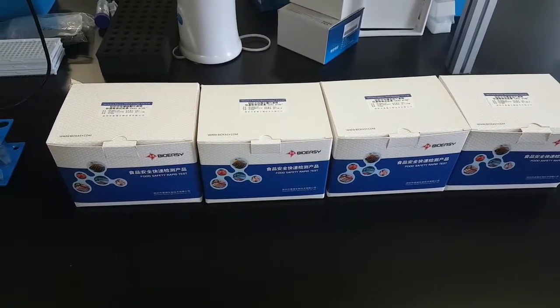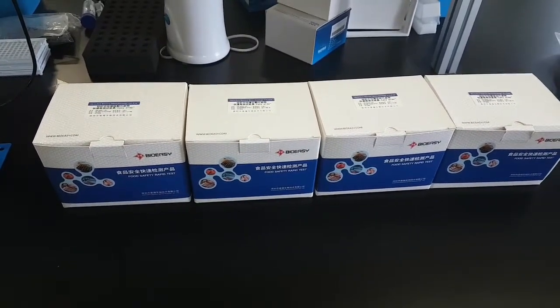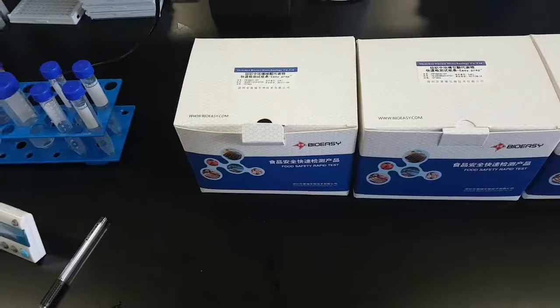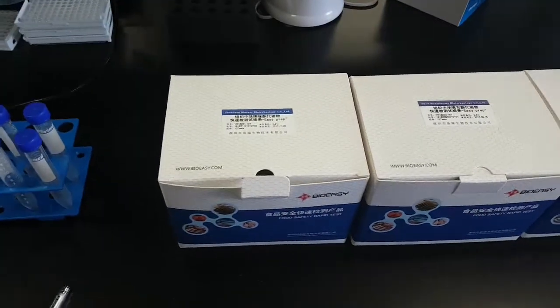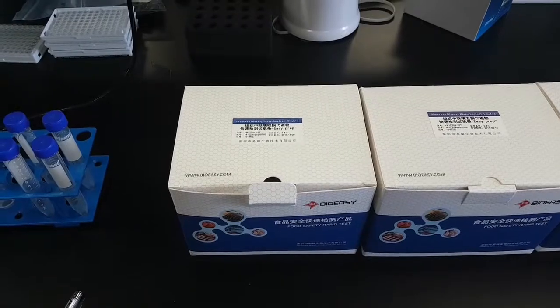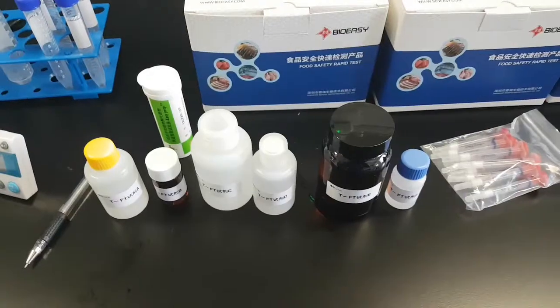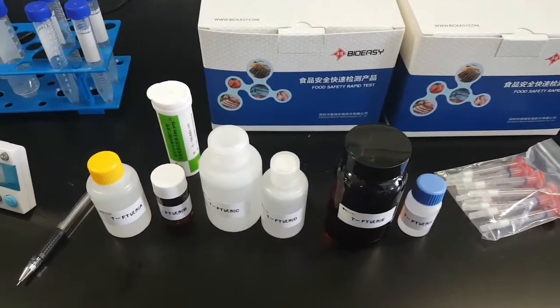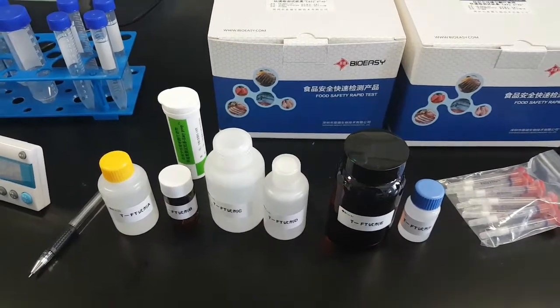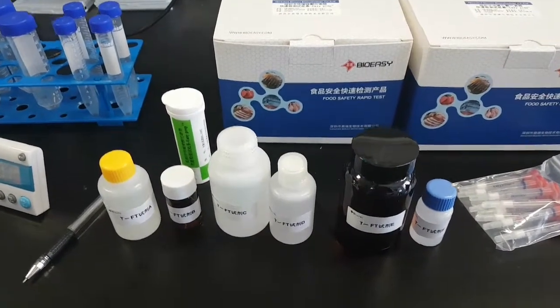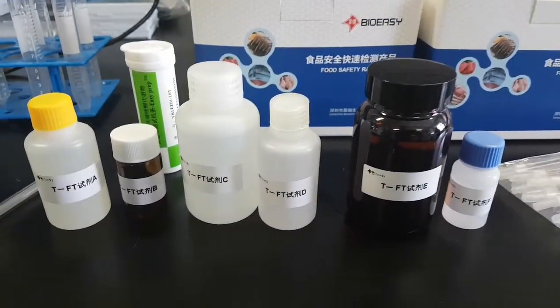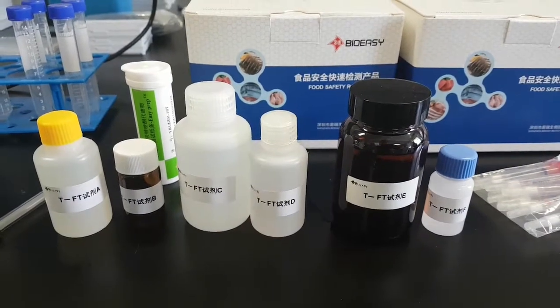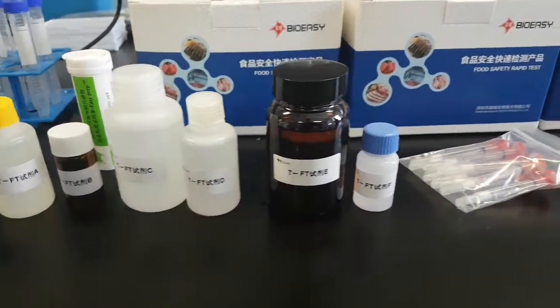AOZ rapid test kit for tissue. First of all, let's talk about what we have in the box. Apart from the manual, we have one bottle of reagent A, one bottle of reagent B, one bottle of reagent C, D, E, and F.